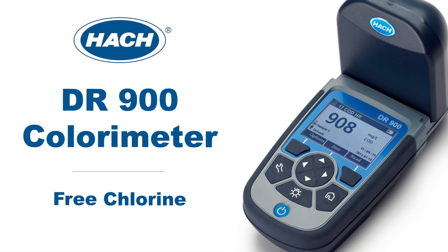This is a demonstration of a free chlorine test using the Hach DR900 colorimeter.